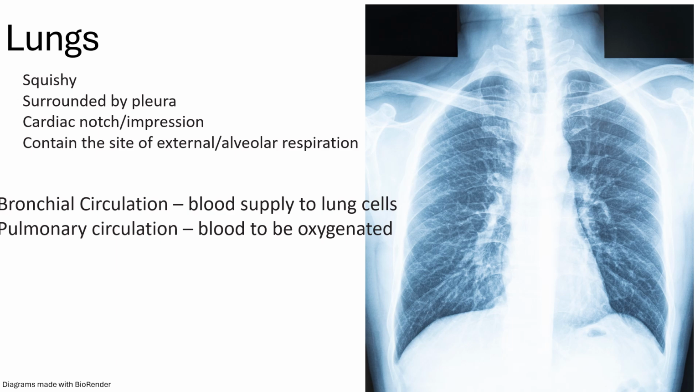When doing dissections of fetal pigs or other organisms, lung tissue is characteristically squishy, which is owing to its porous nature. It's much like a sponge. We already know from looking at the secondary bronchi of each lung that the left lung is smaller than the right lung, owing to that cardiac notch. And this cardiac notch is the space that the heart occupies.